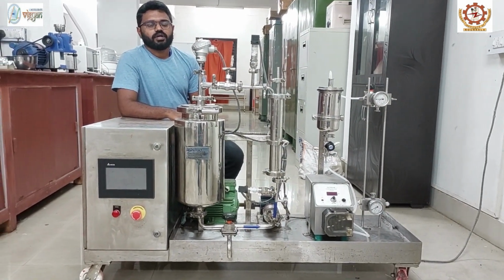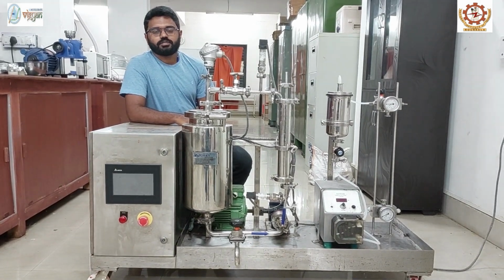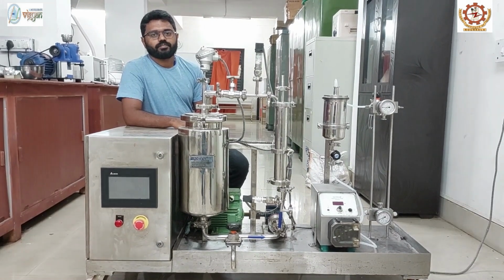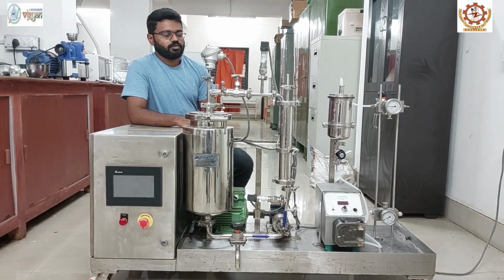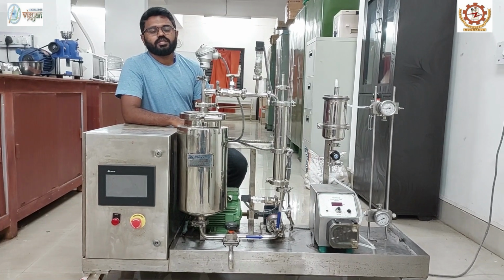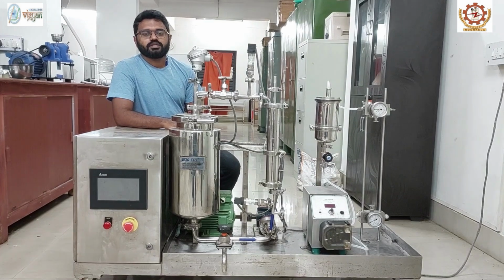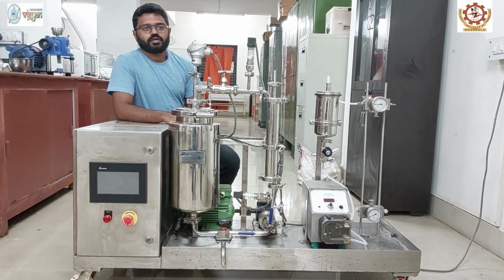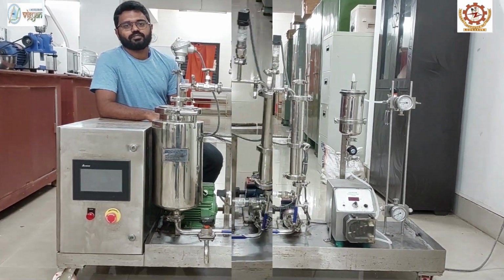Thank you, sir. My name is Abdullah, research scholar under Professor Ramchandra Pradhan, Department of Food Process Engineering, NIT Rourkela. Today, I will be giving a live demonstration video of this membrane filtration system. In this demonstration, I will be explaining different parts, basic principles and working of this system. I welcome you all to this live demonstration video.